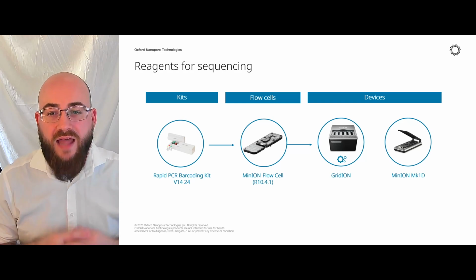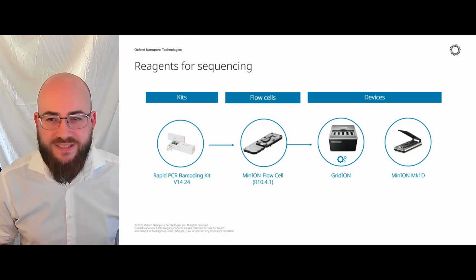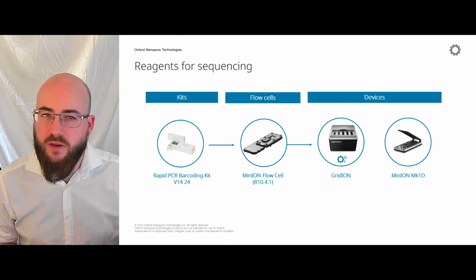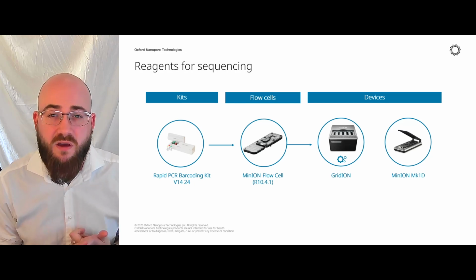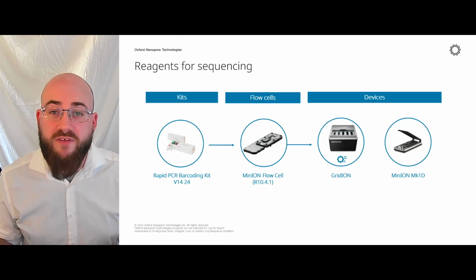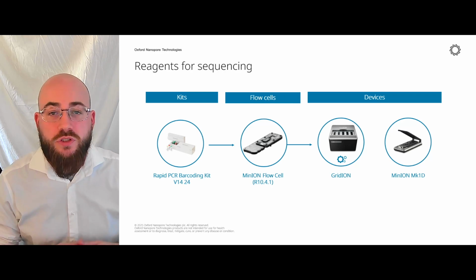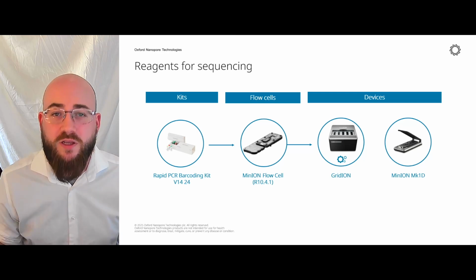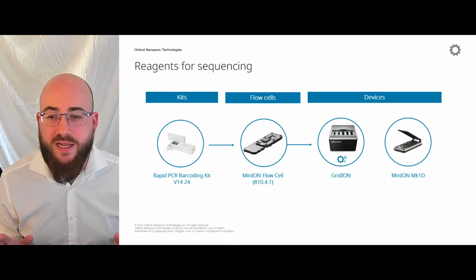And then once we've done that, we've got our sequencing on, it's on the device, it's analyzing in real time. The default settings for barcoding for this kit are for 72 hours using high accuracy base calling, but you could run it for less, right? You're flexible to that. You could do your analysis earlier. You could take it off at 24 hours. You could look at it in real time when it comes to doing your analysis.